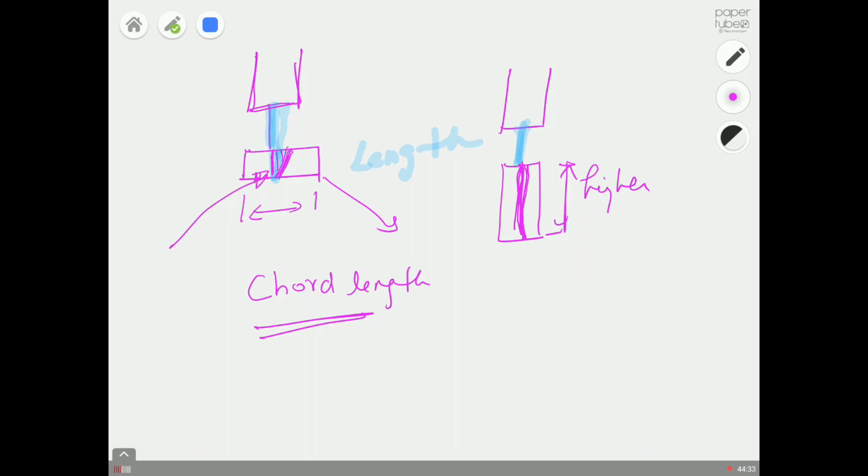So on average we will get decently correct results that can capture the information about the size fraction, and the percentage of crystals under each size fraction. So it's a good technique. So try to write about the working principles of chord length.